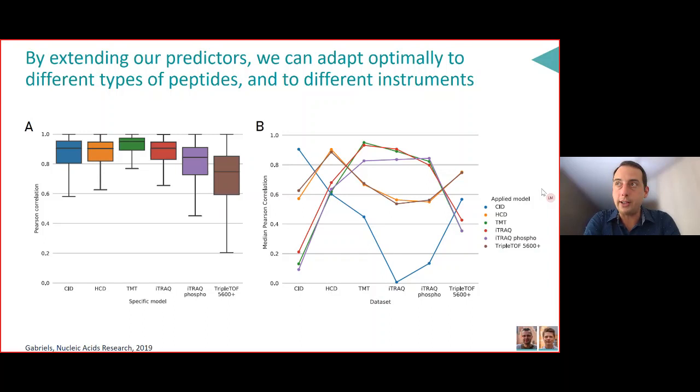As soon as peptides get a little bit longer, what we saw was helicity gets more important. Very interestingly, you see that when you have 4 residues or more in the fragment ion, which is exactly 1 turn of an alpha helix. So that's exactly where you would expect helicity to become important. Why? Because it probably stabilizes the peptide while it's flying. So now it's difficult to break it again. And so that probably helps there. So we can get this kind of information out of this.